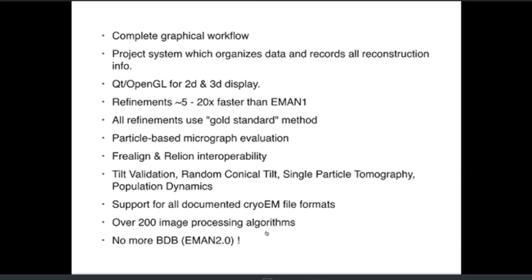So, things that are good about Eman. We have a complete graphical workflow interface, which I'll show you in a couple of minutes, which allows particularly novice users to go through the pipeline for single particle reconstruction or for subtomogram averaging. And it's honestly not just for novices. I actually use the workflow interface myself because I find it more convenient to go through the pipeline in a consistent way.